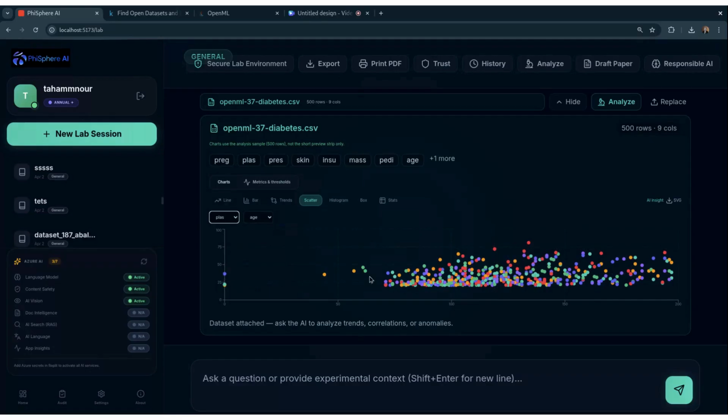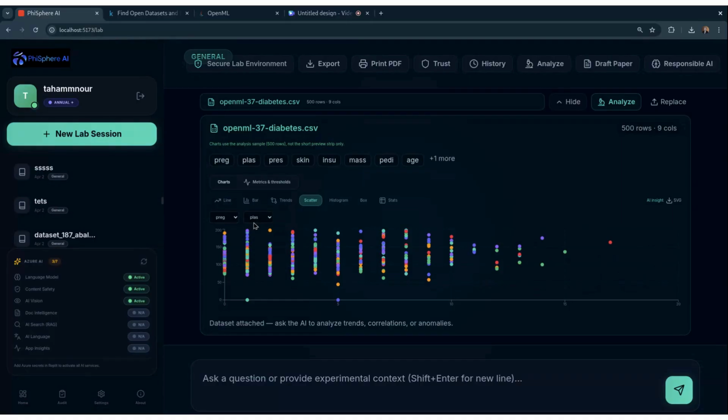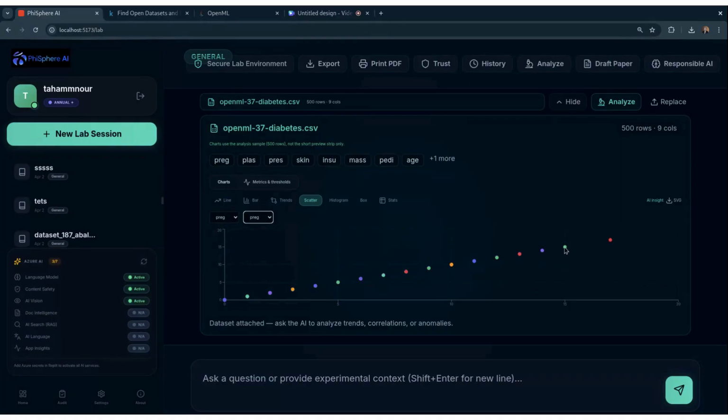So, if you see mostly grounded 75%, you can explain it on camera like this. The system is telling us that the response is mostly grounded in the information it had access to, and it is not purely speculative. If the groundedness is lower in another run, you should treat the suggestions as hypotheses that you need to validate experimentally.